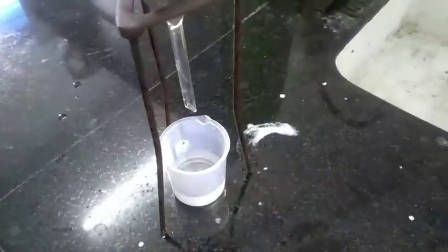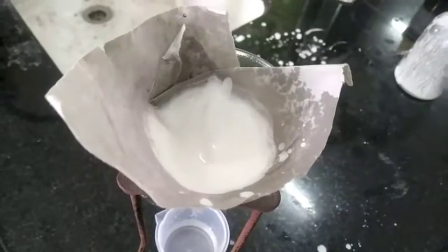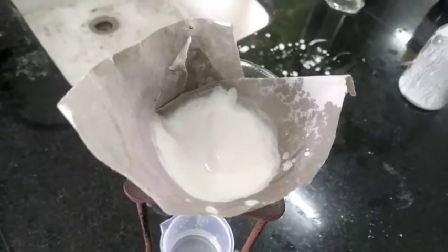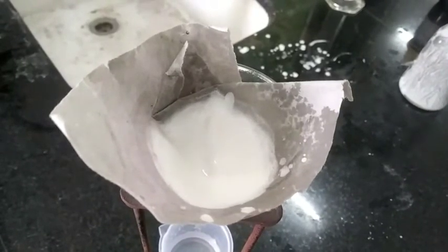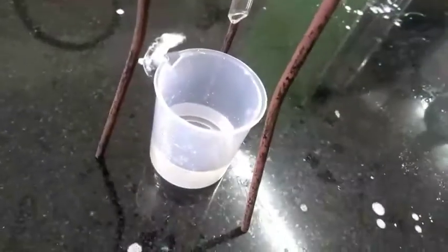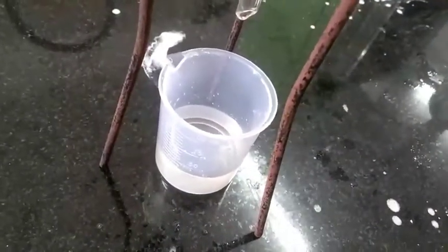Why did we do this filtration process? Because we want to remove this talc from our preparation. But why do we use talc powder? To remove excess amount of oil, and we use it as an absorbent. Now your peppermint water IP is completed.